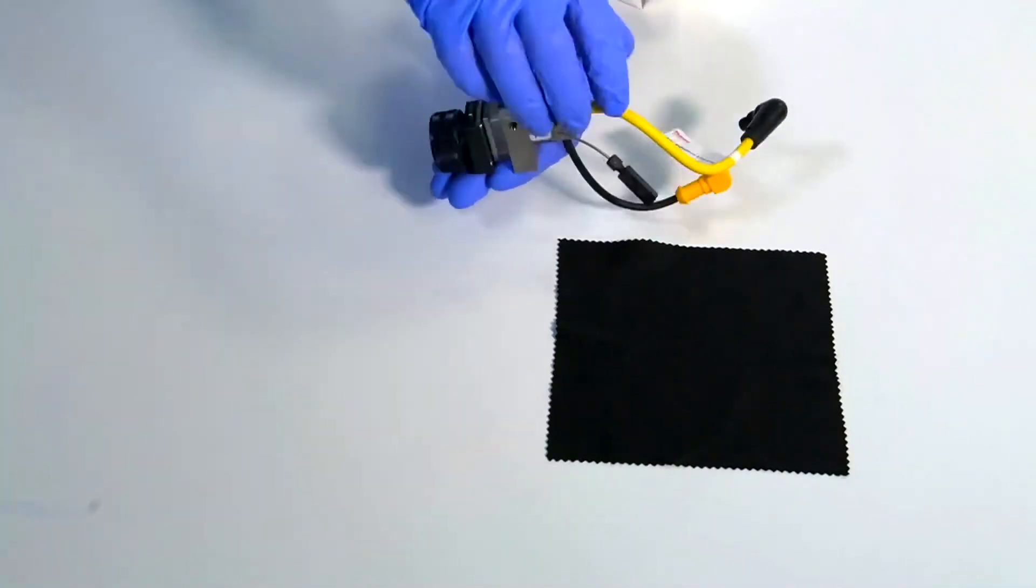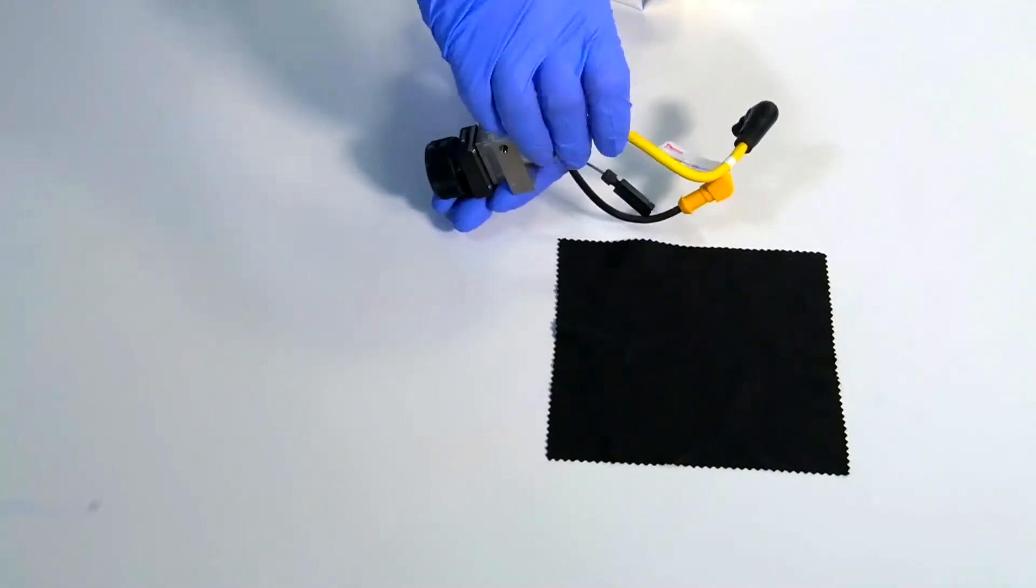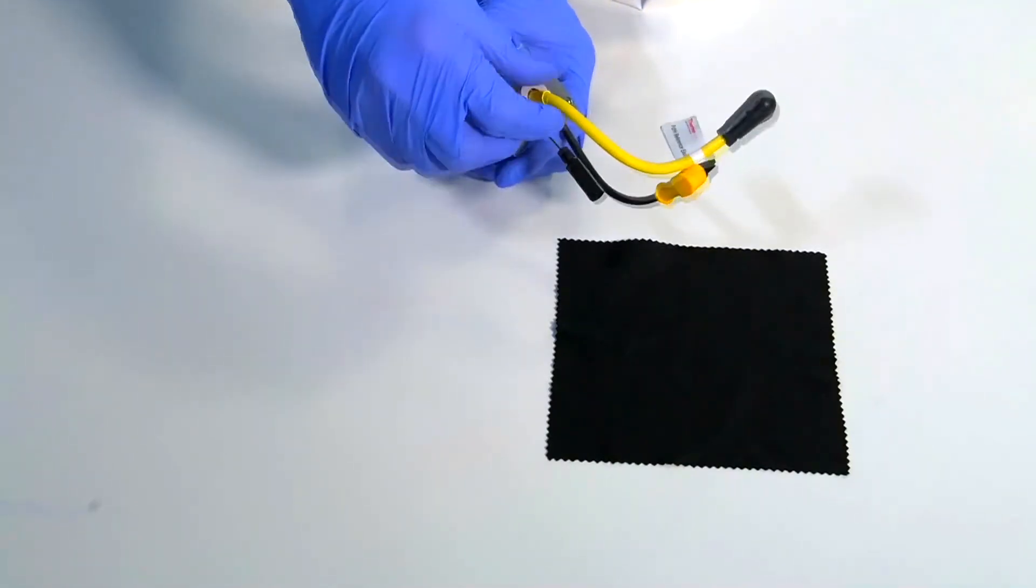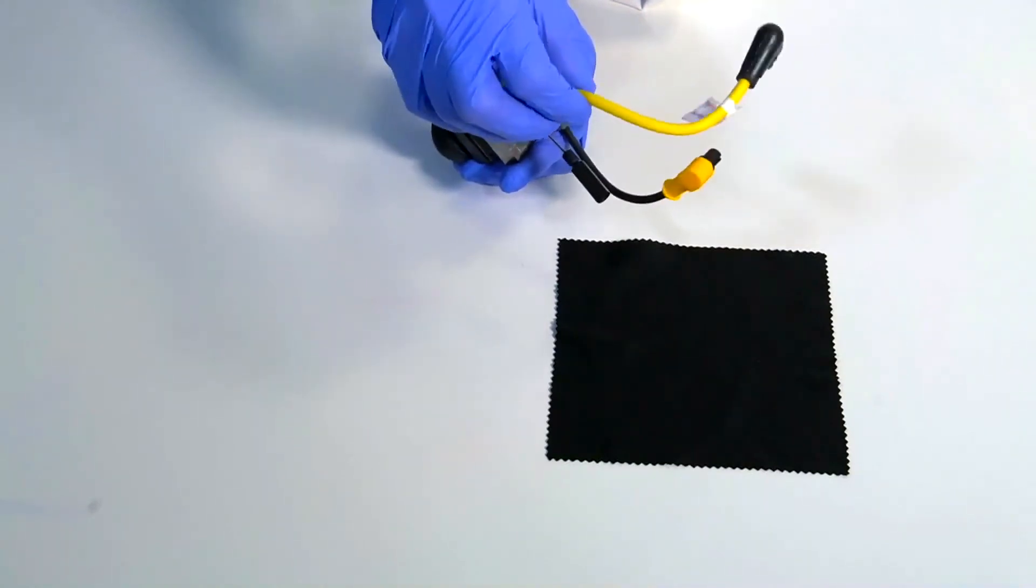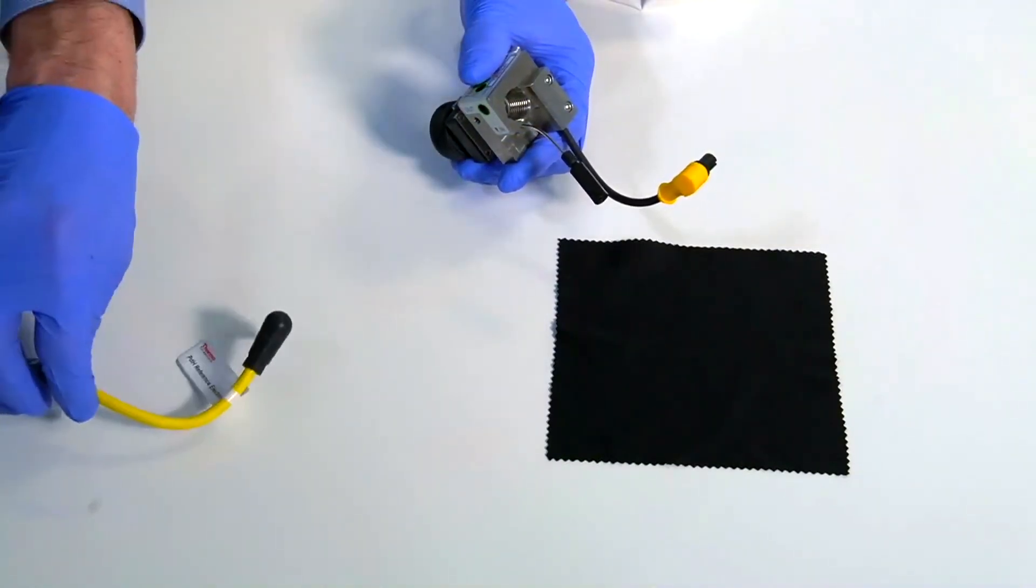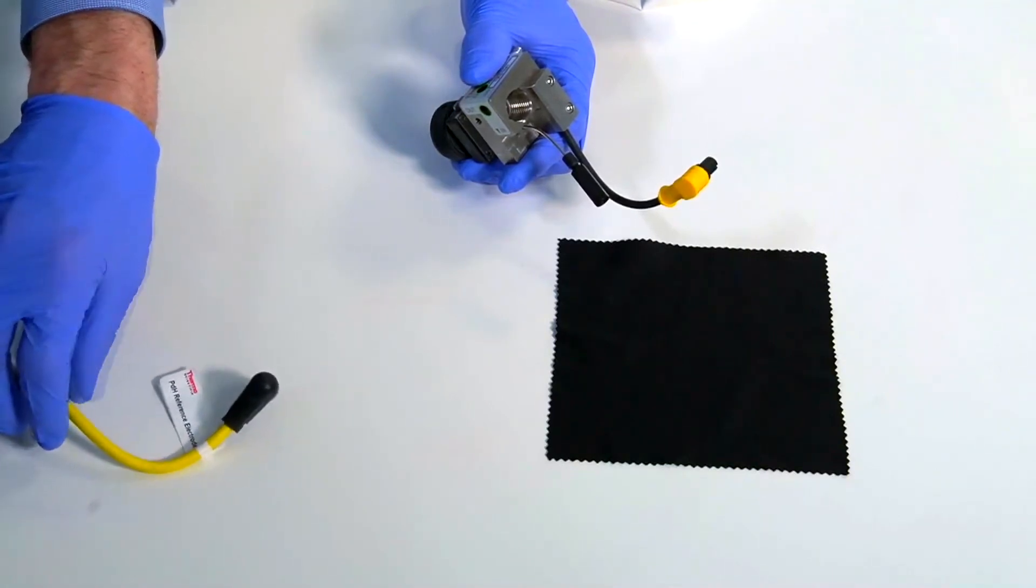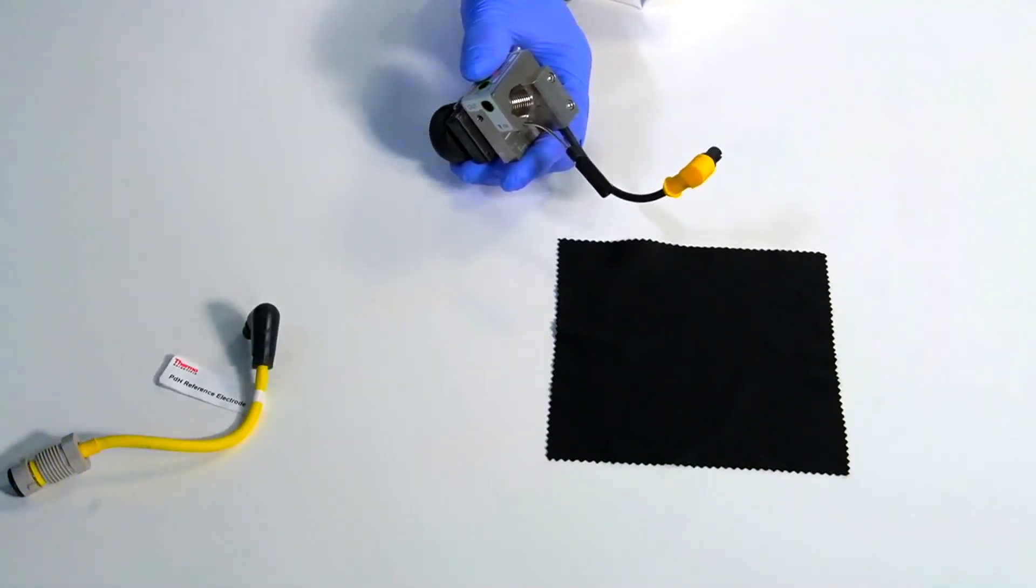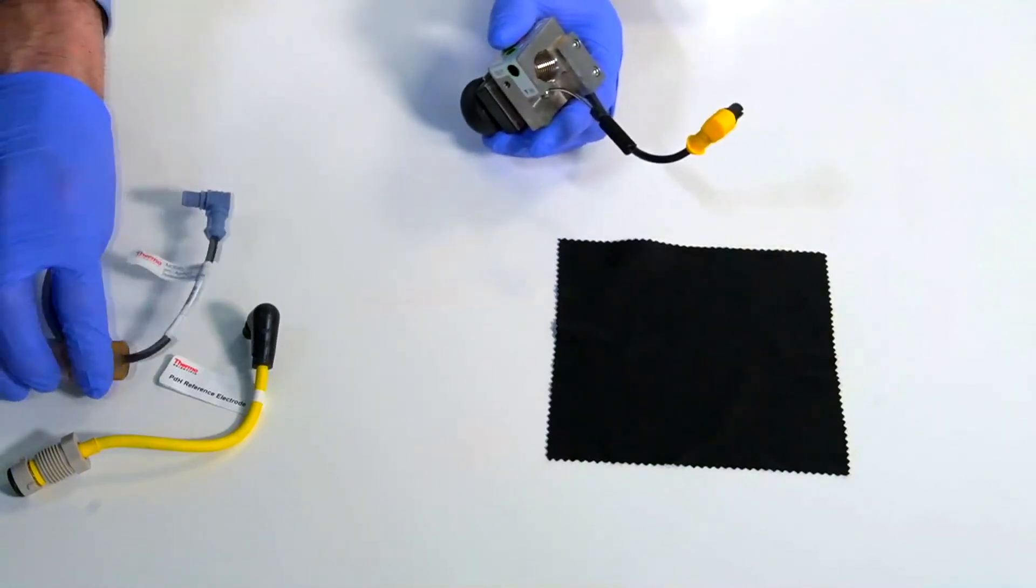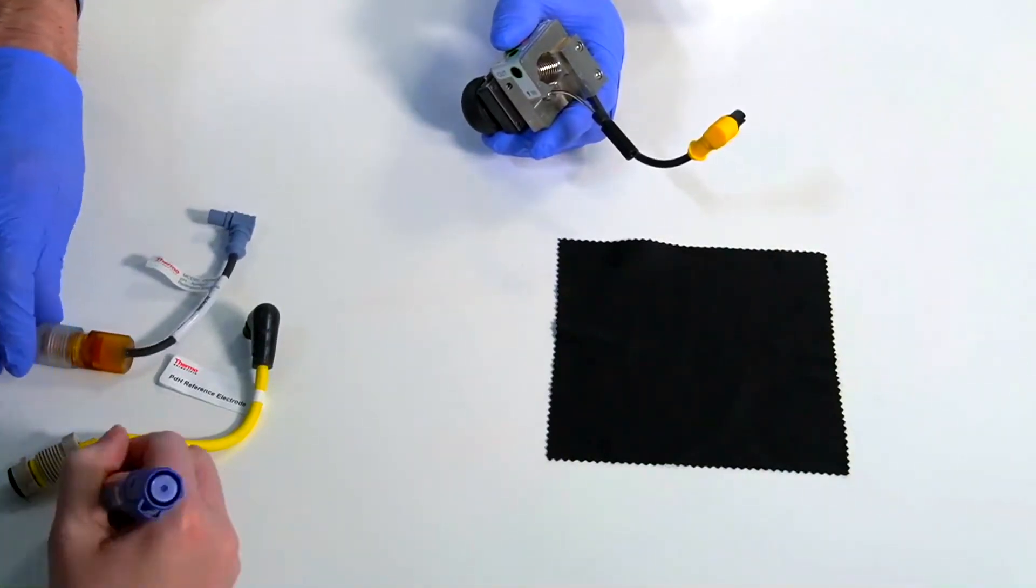First I'll remove the reference electrode by unscrewing this fitting here. This one's called a PDH electrode. The other type of reference electrode that you may have is a pH and silver silver chloride electrode. We'll talk more about those later, but that's the way the two different electrodes look.